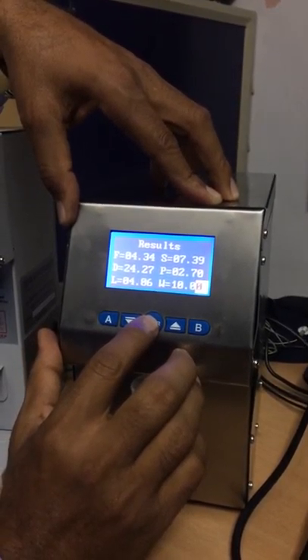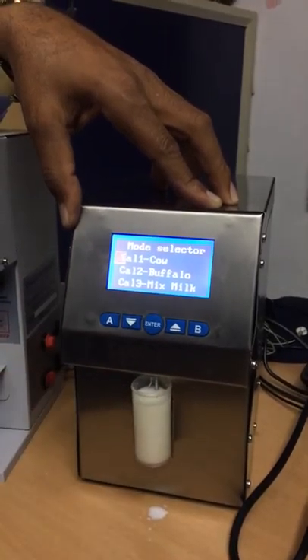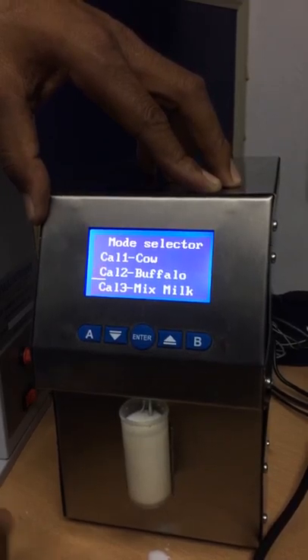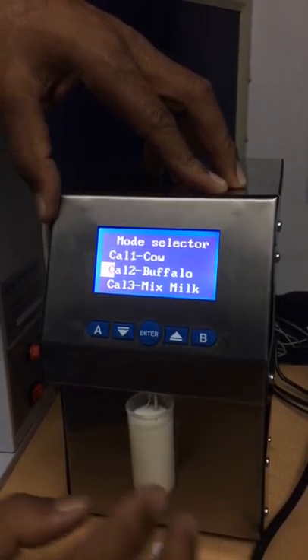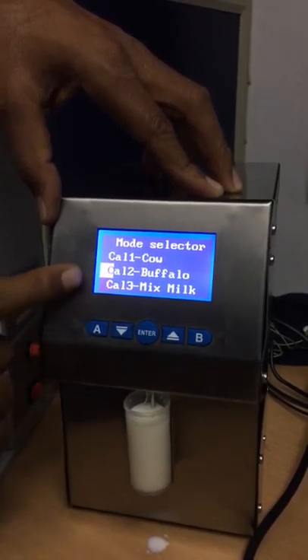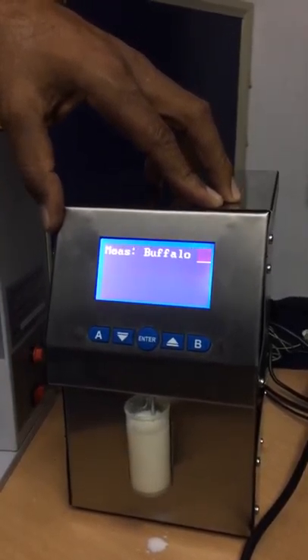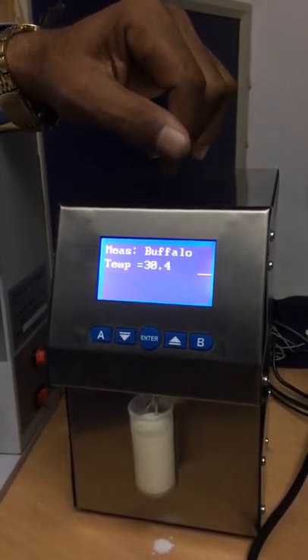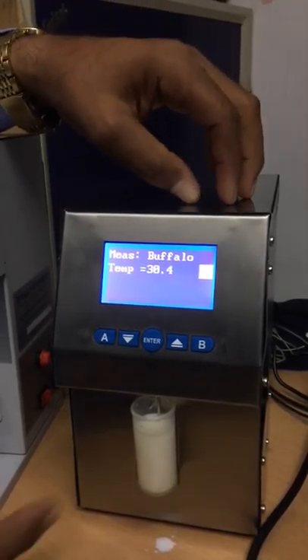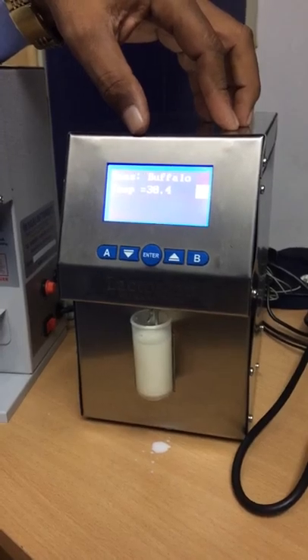If you want to check the buffalo milk, just long press the Enter key. Here is the menu selection — you just go right. I don't have buffalo milk, so I just demonstrate with the same milk. Now we are in buffalo milk mode — press Enter. See, the temperature is already raised because the milk was used a second time.